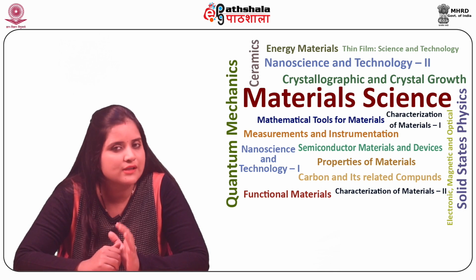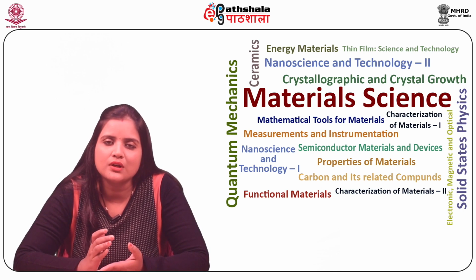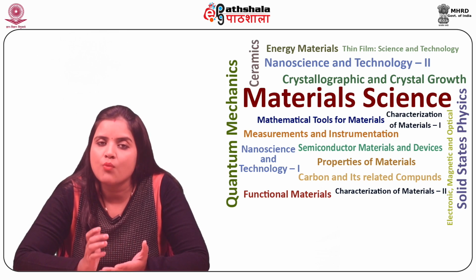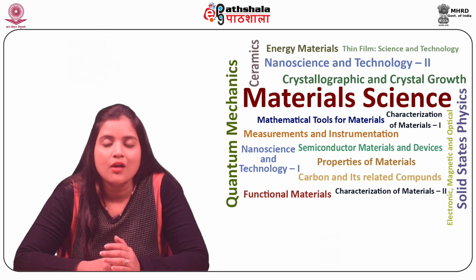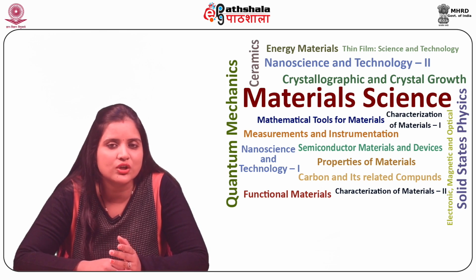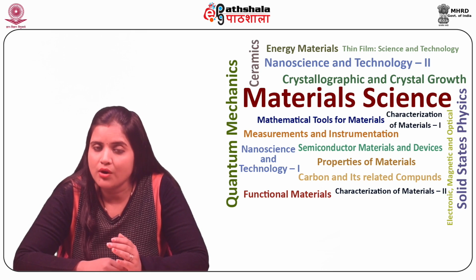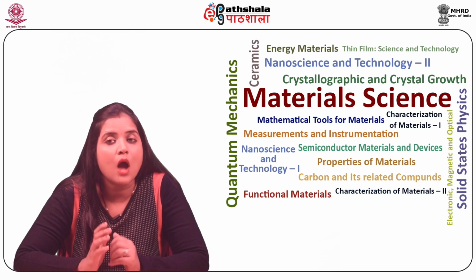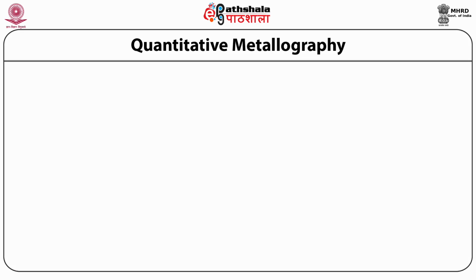Most commonly studied samples are bacteria, muscle tissues with pronounced striations, as well as samples having small definable structures. Further, the samples to be investigated must not be sensitive to the oil because acidic oils may deform the specimen having metallic species. Let us next study quantitative metallography.